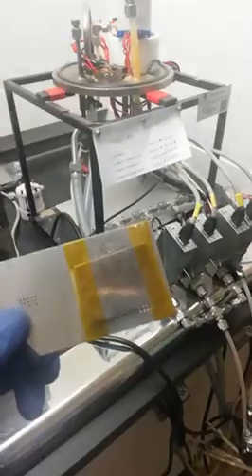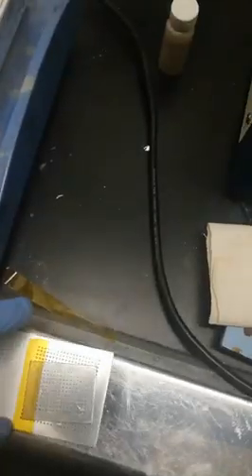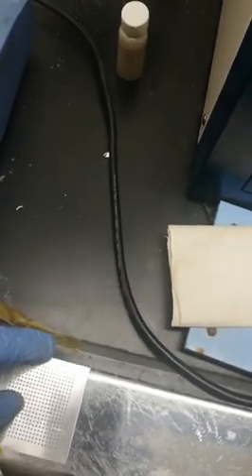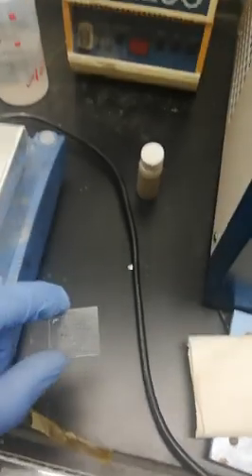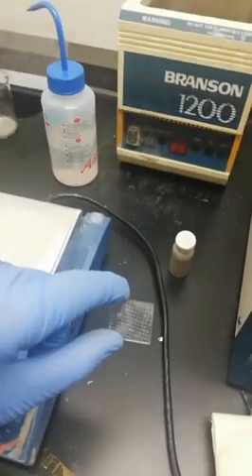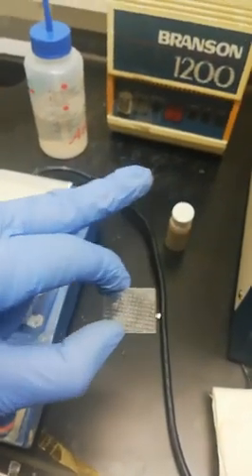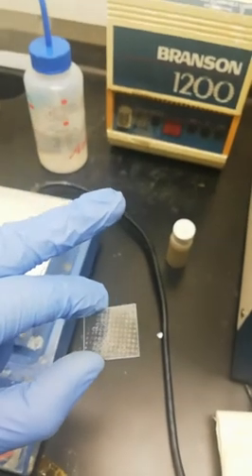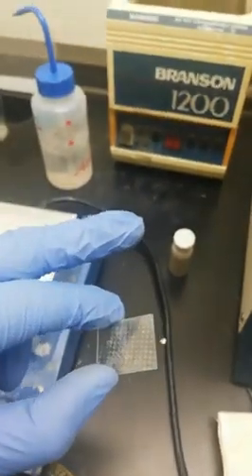We are done with the spray coating. Now we will see by removing this mask whether we have got the electrode or not. You can see the electrode is not really very dense because my nanowires are not too dense, but you can still see the electrodes and you can probe your needles for the characterization.